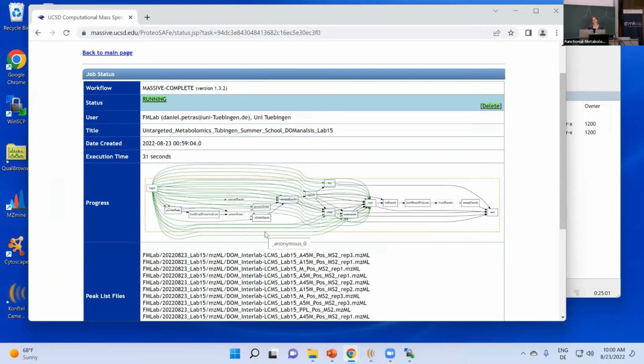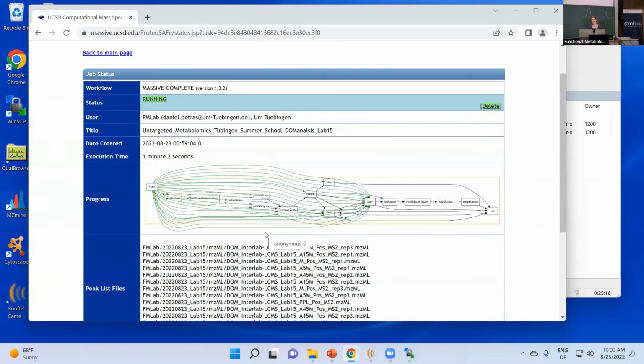Yeah. So I like keeping it in one folder personally, if it's the same data set. Maybe you forgot to run a few samples, or you realize that those samples were misinjected or something happened, or you run a different method. Exactly. I would add that to the same data set, but it's personal preference. But I personally would do it.